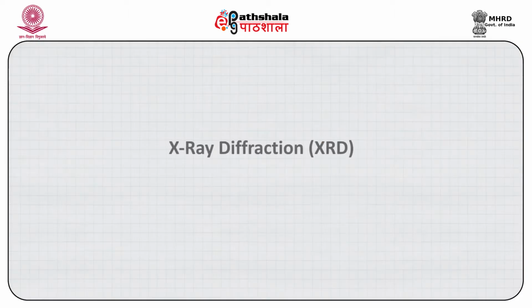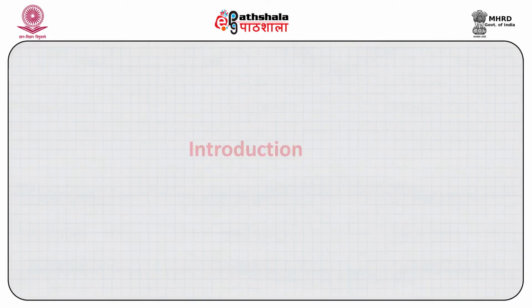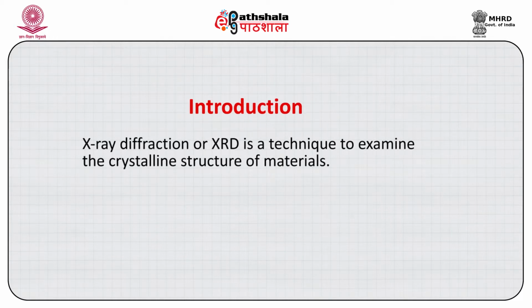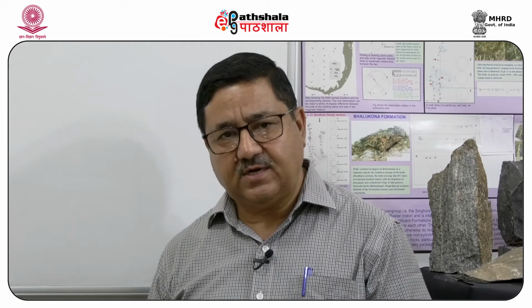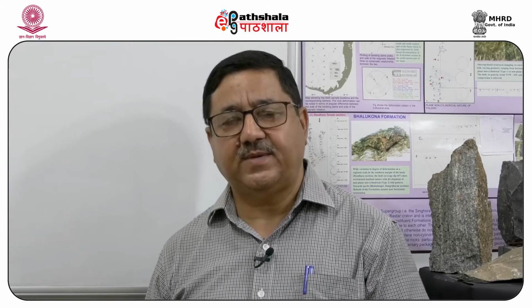Today we are going to talk about X-ray diffraction. The point is, why do we require to investigate a material by X-ray diffraction? The purpose of using X-ray diffraction for geological material is to examine their physical property in terms of its crystallinity. Most of the minerals are crystalline material.